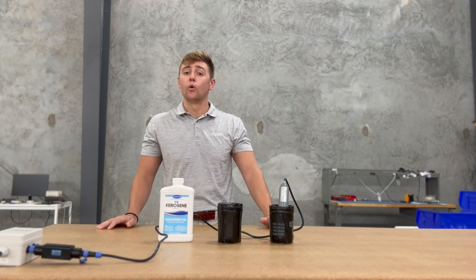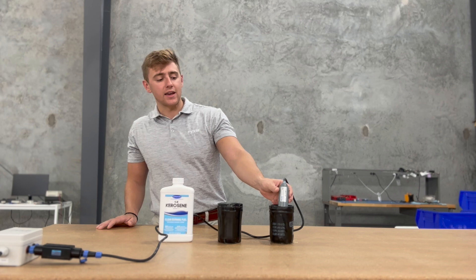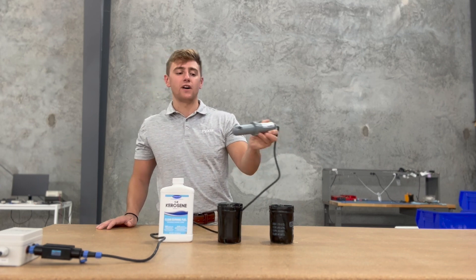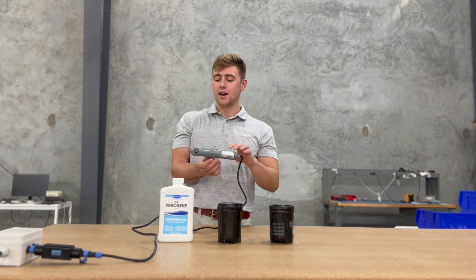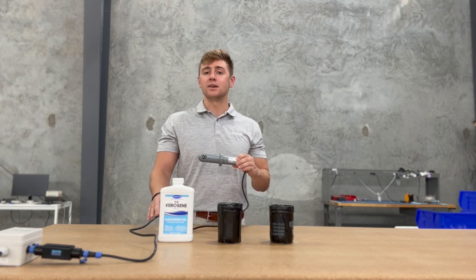This is the HM500 series oil and water sensors. They have a very similar body type to the ST500 or PTSA sensor. It has that flow channel. It's a lightweight sensor, seven pin design.